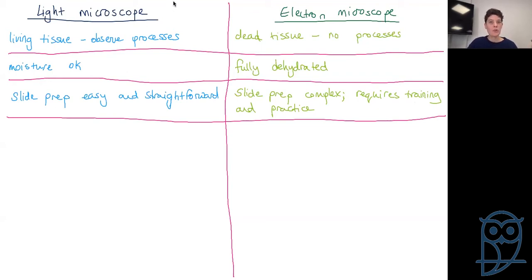Other thing, remember we talked about we have to digitally alter those electron microscope images. Okay, so in a light microscope, you actually see what color it is. You can observe the natural color. This is, of course, if you haven't stained it. If you stained it, then not quite so much of a natural color. But if you don't stain, you can see chloroplasts are green.